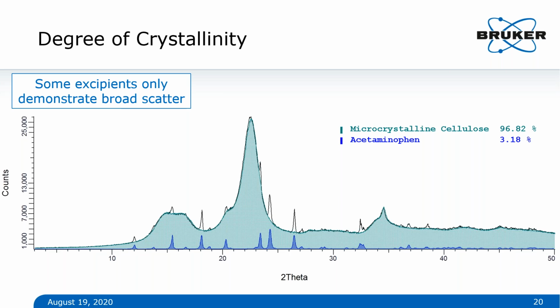But I would say if you are doing any sort of chemical separations, always run your sample first in its native state. Because if you do some sort of treatment, if you try to dissolve out your API and recrystallize it, you want to make sure that when it recrystallizes that you're getting the same form, so that you would see the peaks in the same locations as before. Because if you've done some sort of solvation and extraction and then recrystallization, if you're not careful, you might actually end up with a different structure than you started, or a different salt or a different precipitate.